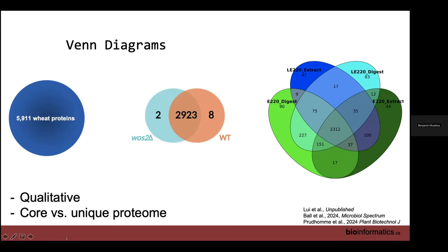And then I have the other one, I'm trying to pull up the laser pointer. Okay. With the other one here, a more complex Venn diagram, and these can be scripts taken with R or Python and different tools used so that you can really compare more of a complex data set. And within these, within the middle there, you have the 2300.